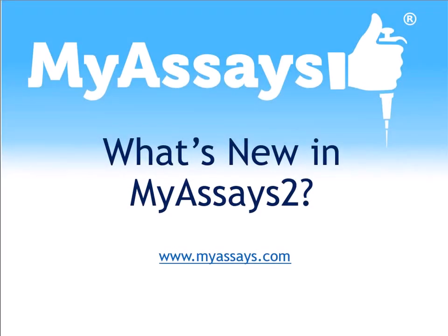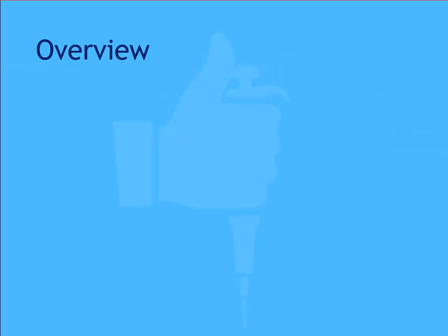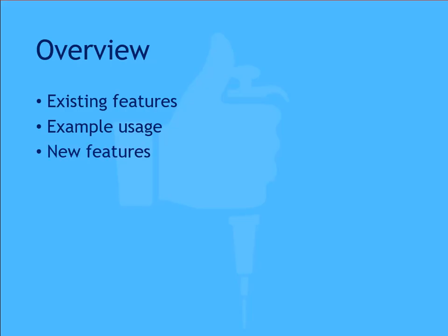In this video, I'm excited to walk you through our next generation platform, MyAssays2.com. If you're already familiar with our current service, MyAssays.com, you'll feel right at home. We'll start by revisiting the key features you already know, and I'll guide you through a step-by-step example of how to use the platform. From there, we'll highlight the powerful new features we've added, and finally, we'll look at how MyAssays.com and MyAssays2.com work together.